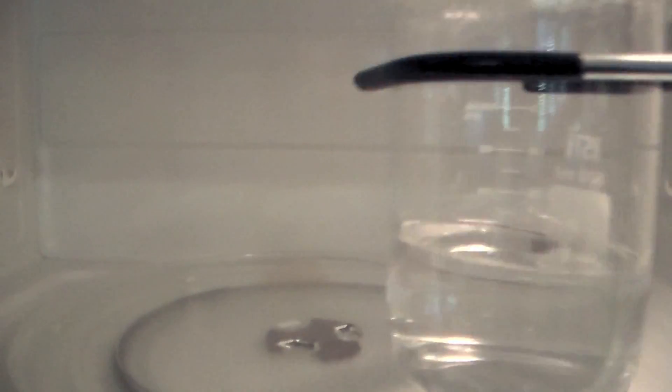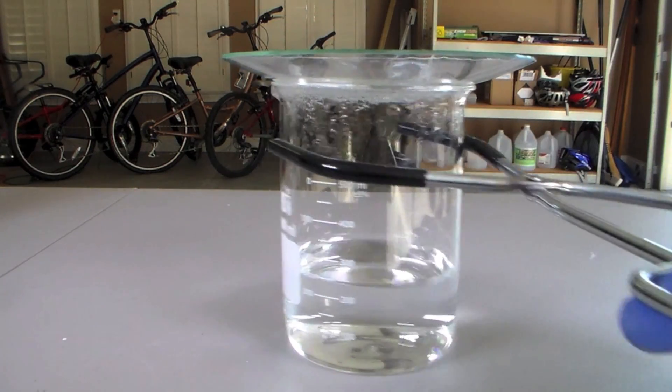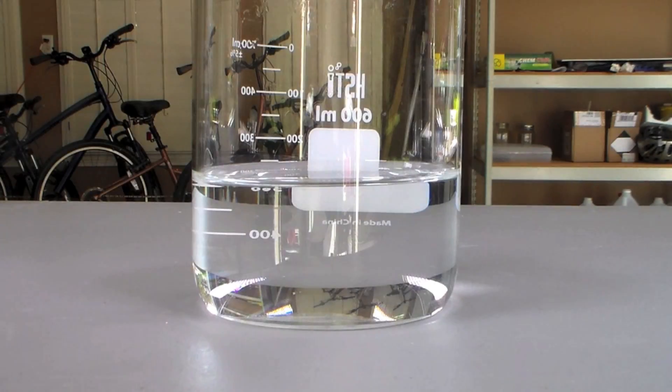Once everything was dissolved, the beaker was removed from the microwave and allowed to cool to room temperature. After cooling, you can see a nice deposit of crystals on the bottom of the beaker.